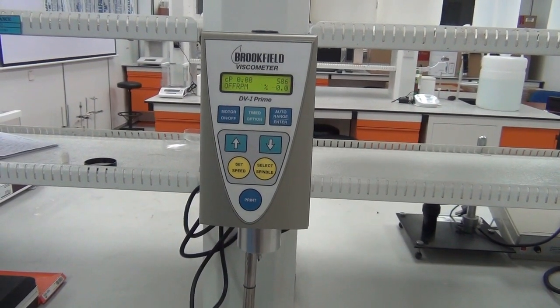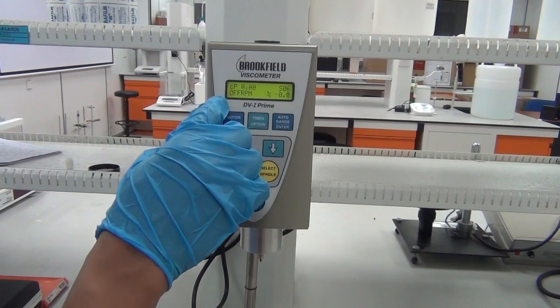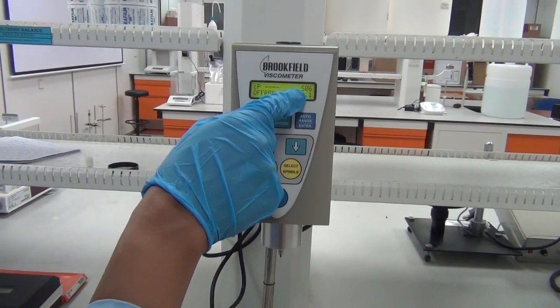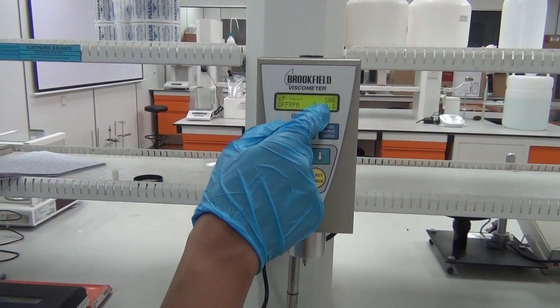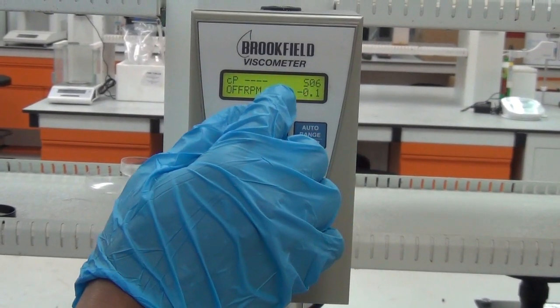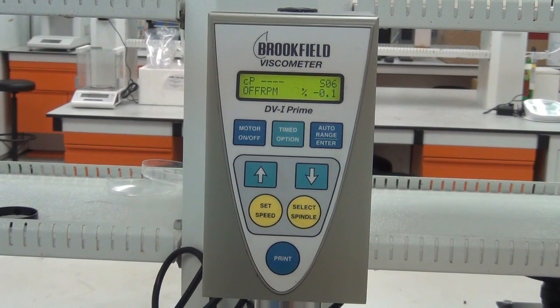Make sure the display shows the value of cP, the RPM, and also the spindle size. At the display it is showing SO6, so we need to change it to SO2. And then for the percentage of error, please make sure it is plus or minus 0.1%.